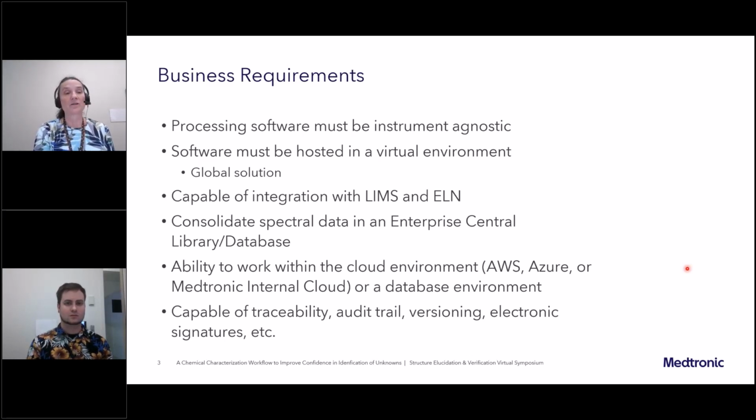The desire was for this to be a global IT solution where the software could be used in different geographical locations, that we could have the flexibility, because COVID was starting to become a reality, of processing data from home remotely. So yeah, that was the requirement for the virtual environment.